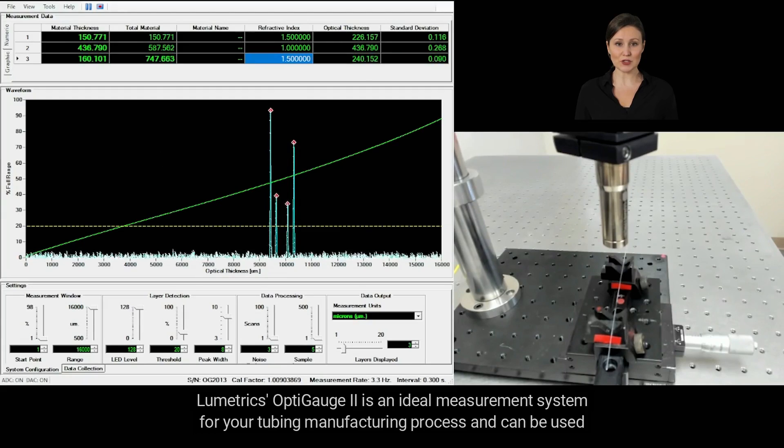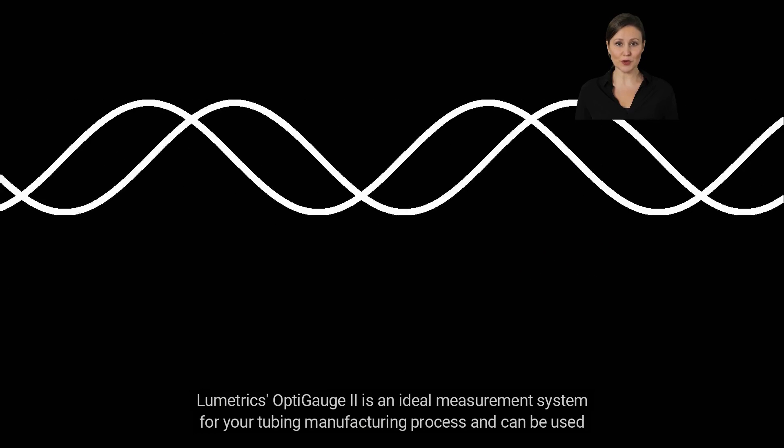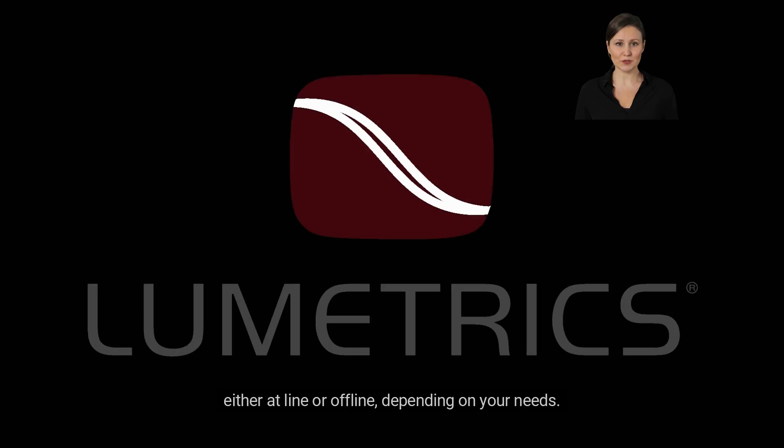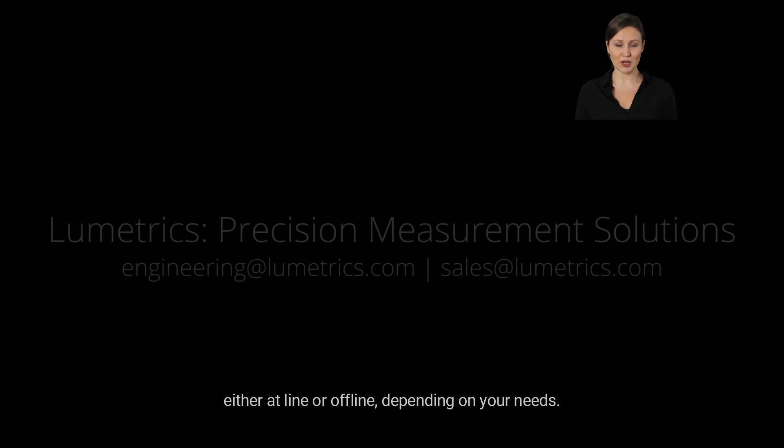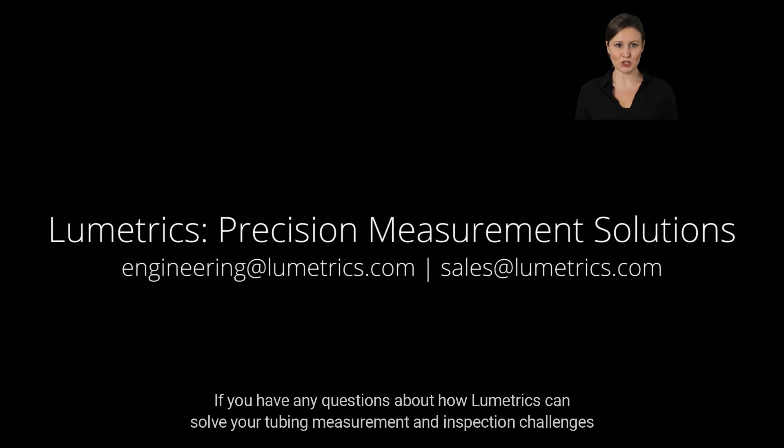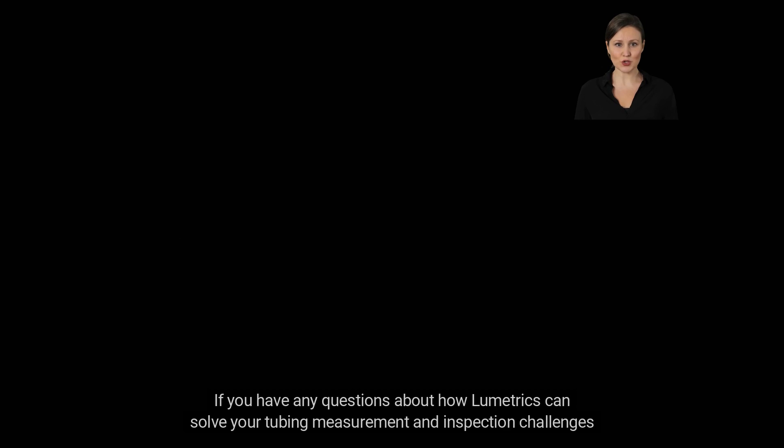Lumetrix OptiGage 2 is an ideal measurement system for your tubing manufacturing process and can be used either at line or offline, depending on your needs. If you have any questions about how Lumetrix can solve your tubing measurement and inspection challenges, please email sales at lumetrix.com or engineering at lumetrix.com.